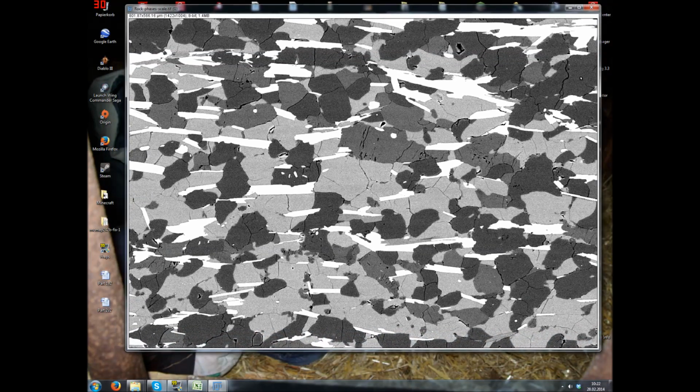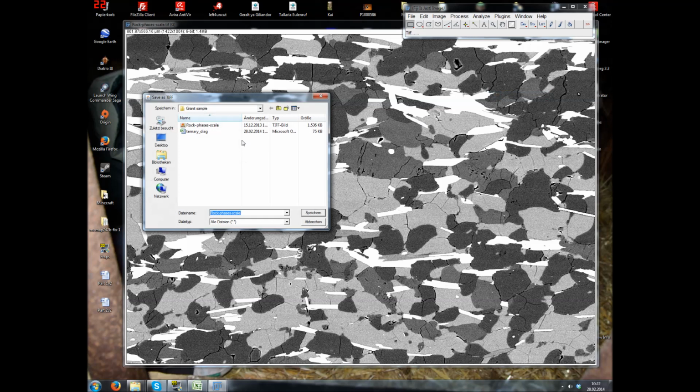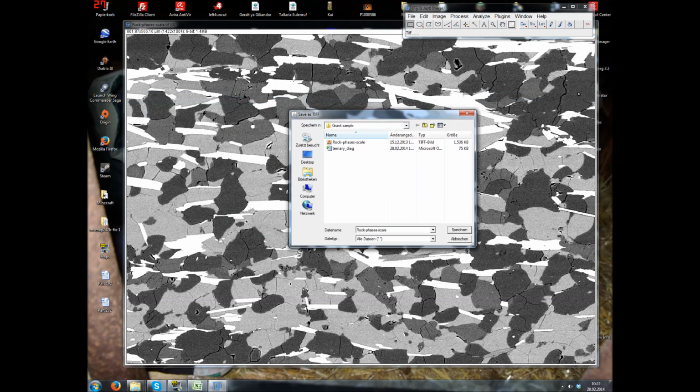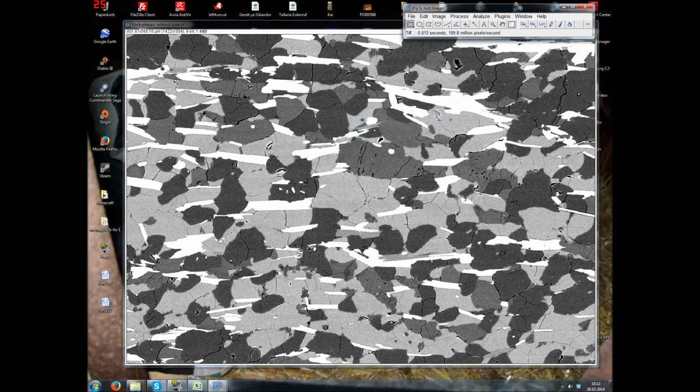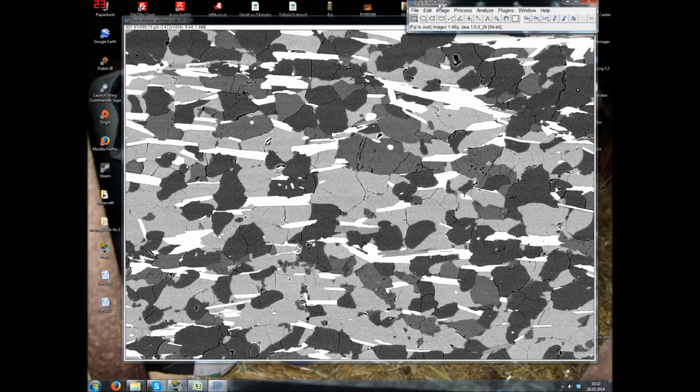Now we get this file, but first of all we should save this file as a TIFF file so we can analyze it and don't mess up our original file.